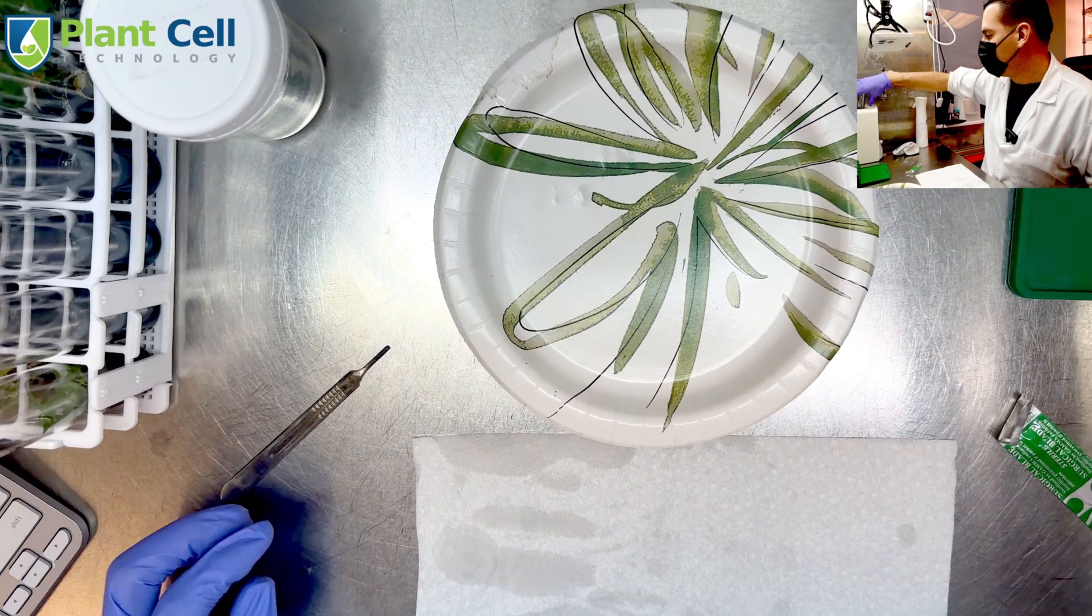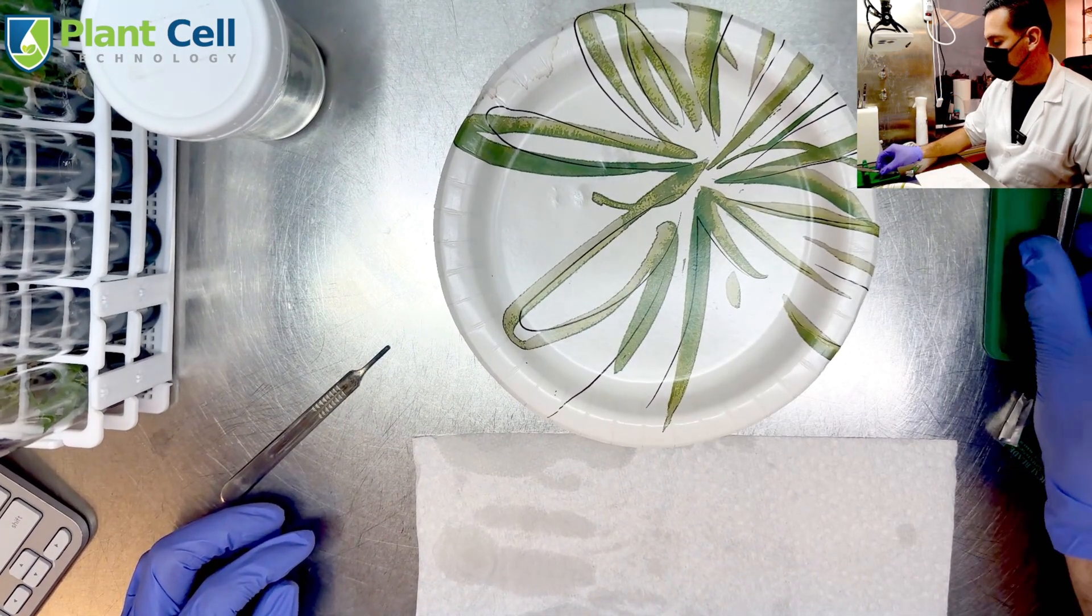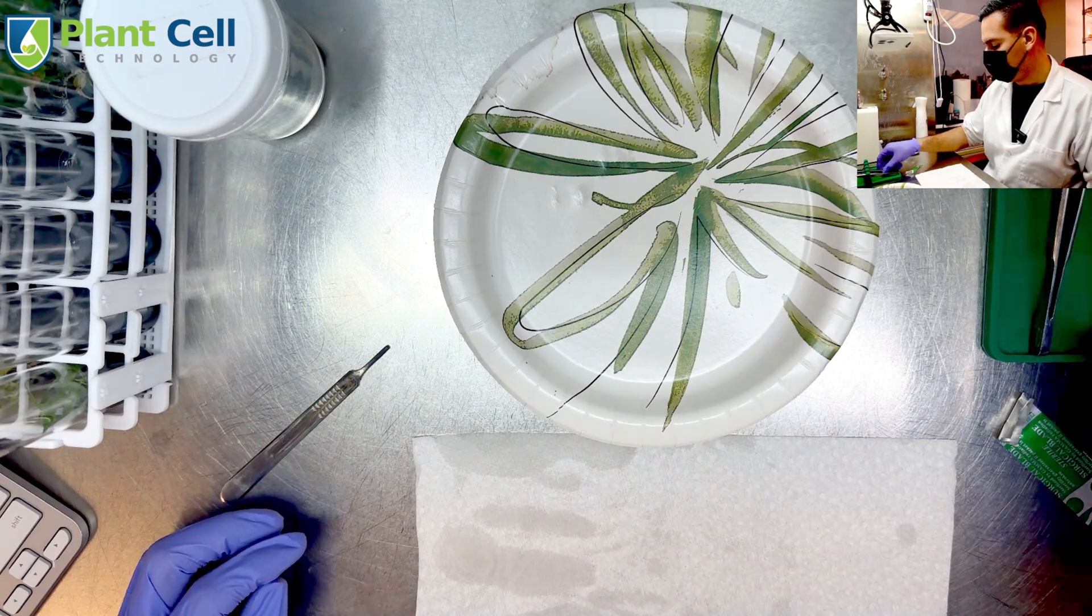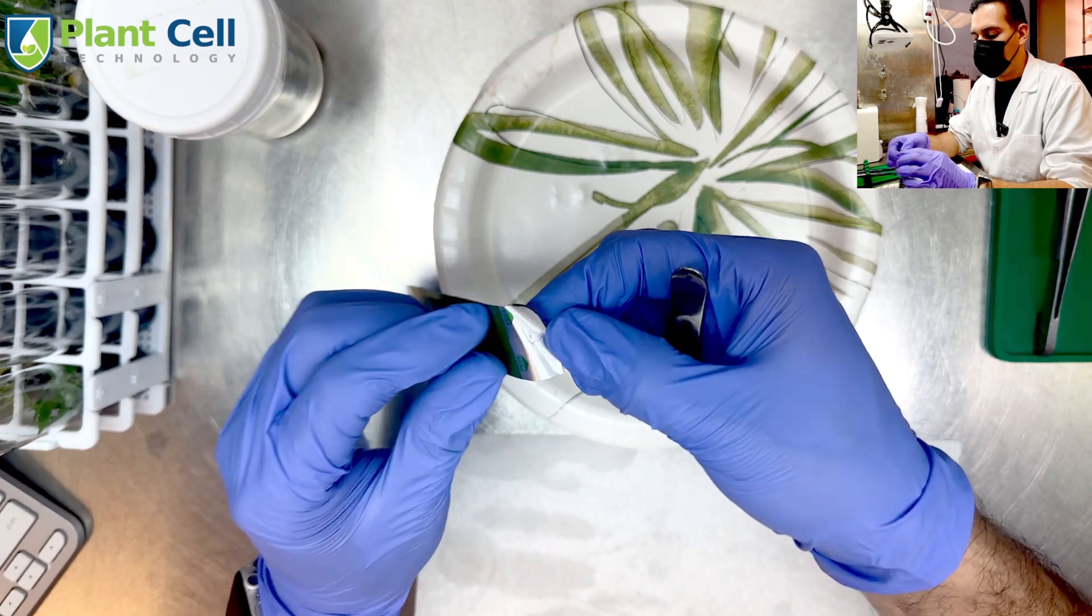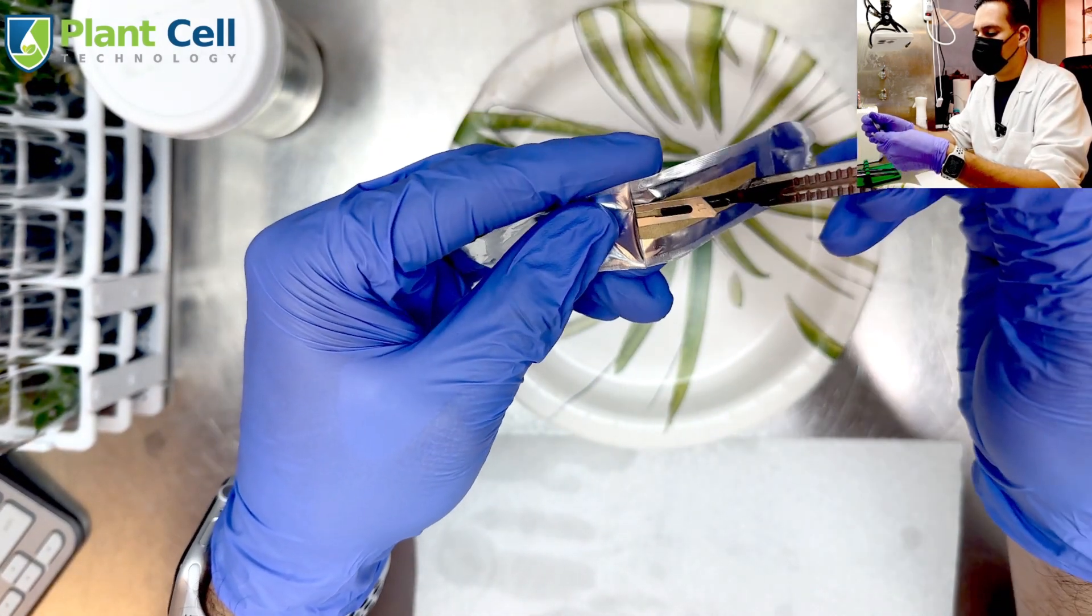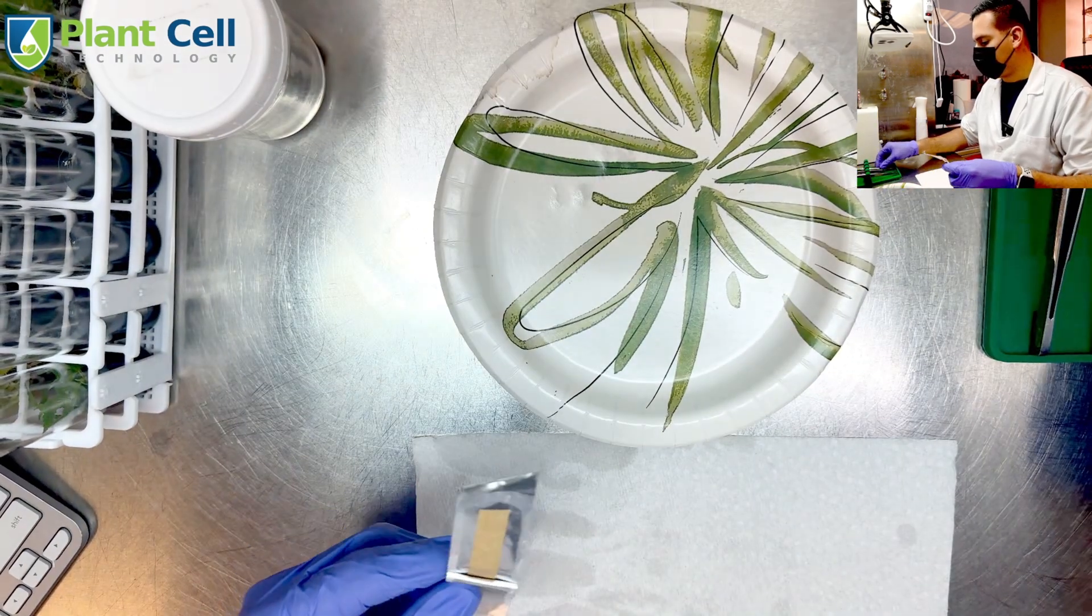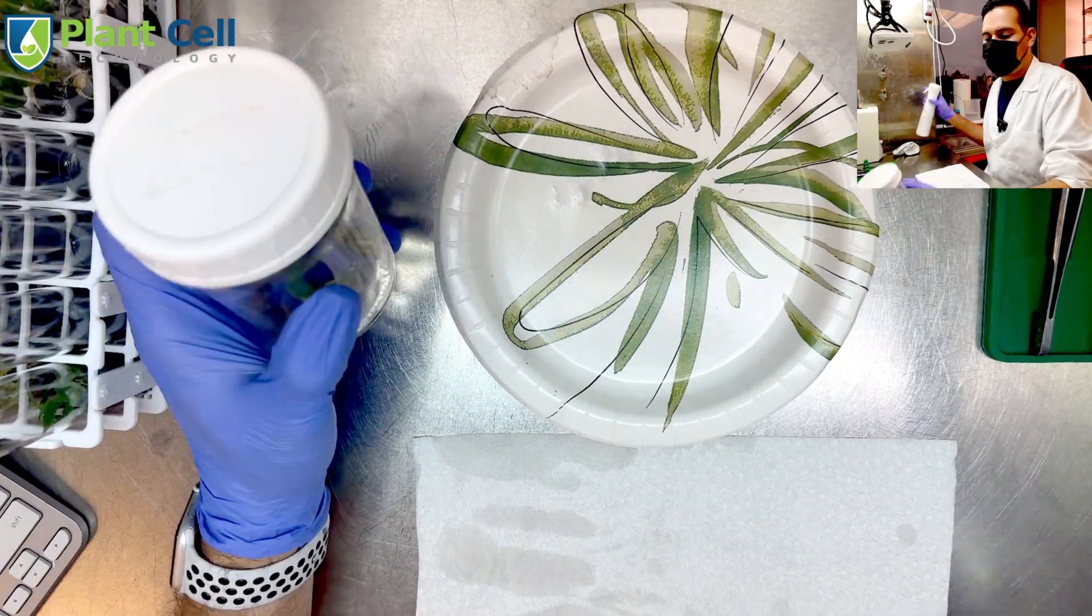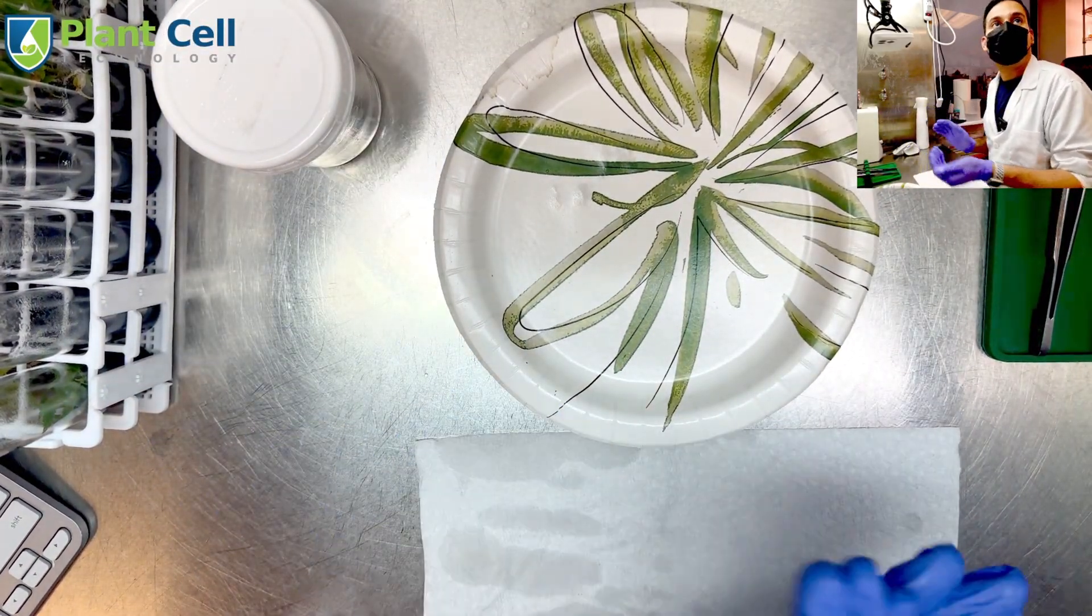I want to take my forceps out of the sterilizer and let them cool down. Also I want to take my scalpel and my blade. I'm going to put the blade in the scalpel like this. Now again, before I do anything I want to spray my hands.